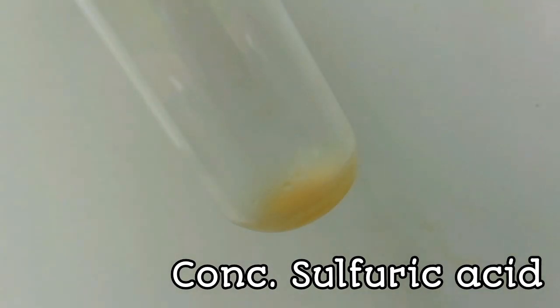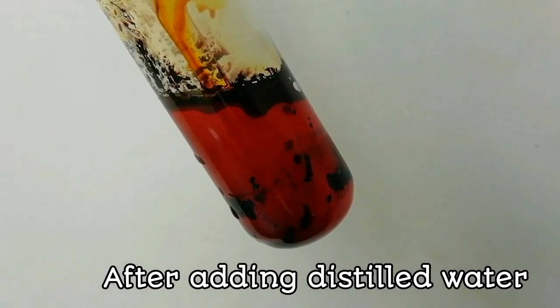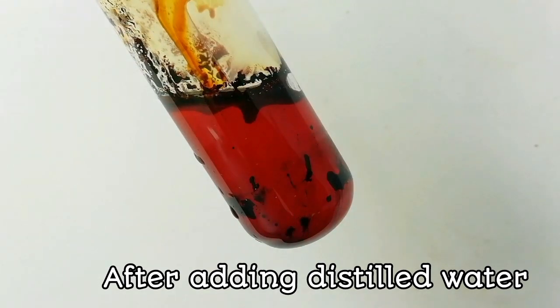Now slowly add a few drops of concentrated sulfuric acid along the wall of the test tube. When it meets the mixture, it gives a blue coloration due to p-nitrosophenol.